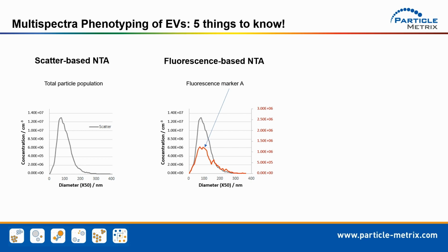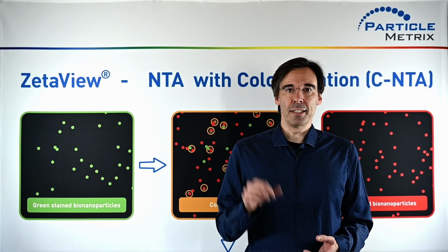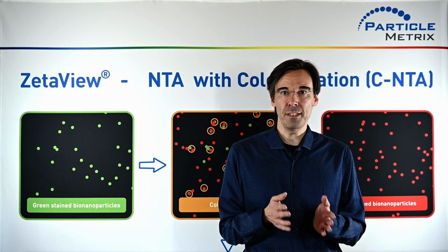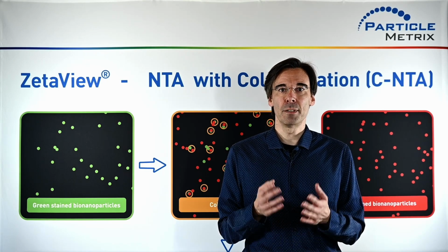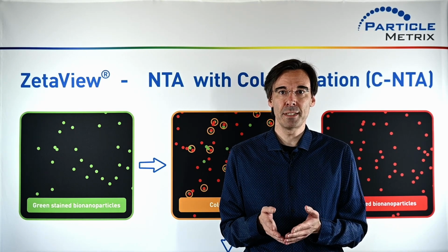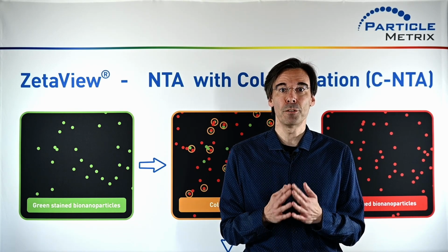So far, so good. But what if you could determine 2 or more specific fluorescence markers simultaneously in your EVs in one single colocalization measurement? And what if you didn't have to do without precise size and concentration measurements in the individual fluorescence channels? Here are 5 questions and answers about colocalization NTA to help you improve and optimize your EV research. At the end of the video, you will have a better understanding of how colocalization NTA works, how you can plan your experiments, and I will give you a few tips and tricks on how to establish the fluorescence staining for colocalization NTA.